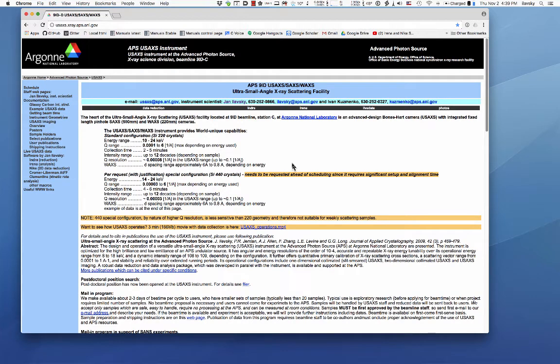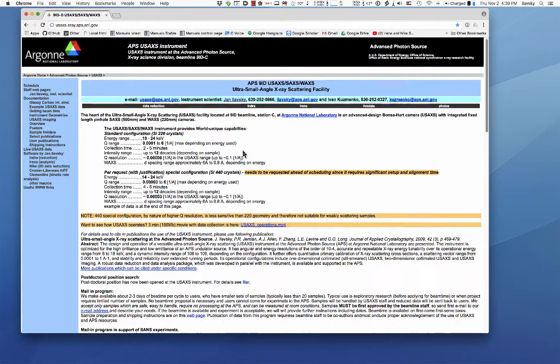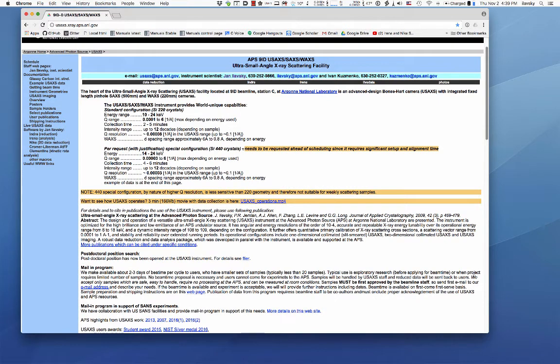This tutorial will navigate you through data reduction of data from the USAXS instrument. Let me do a brief introduction about the USAXS instrument — our ultra small angle x-ray facility at the Advanced Photon Source at beamline 9ID. If you look on the webpage usaxs.xray.aps.anl.gov you will find the most up-to-date information about the instrument itself. This is a very unique instrument providing probably the worldwide widest range of scattering vectors measurable in one measurement. It is a combined advanced design Bonse-Hart camera with integrated fixed-length pinhole SAXS camera and a WAXS camera.